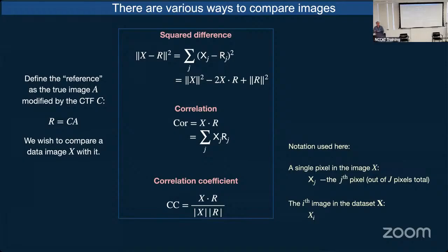Now people just use the same kind of reconstruction algorithm I'm going to tell you about, but just start with a random model. And most of the time it works just great.